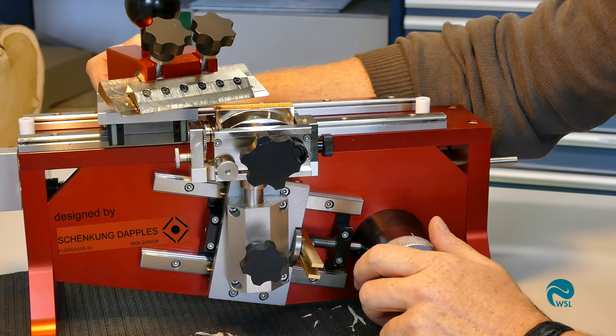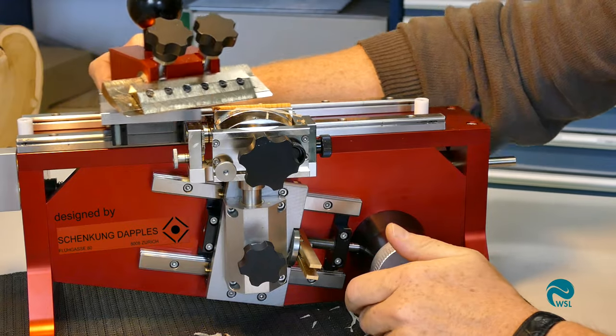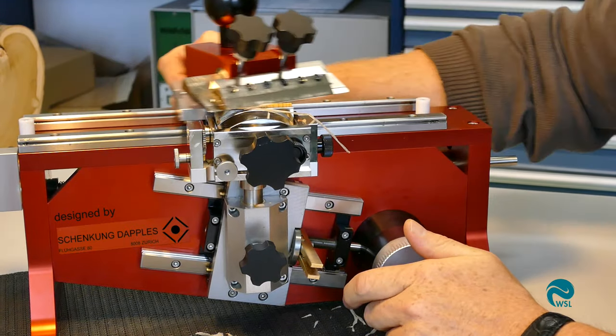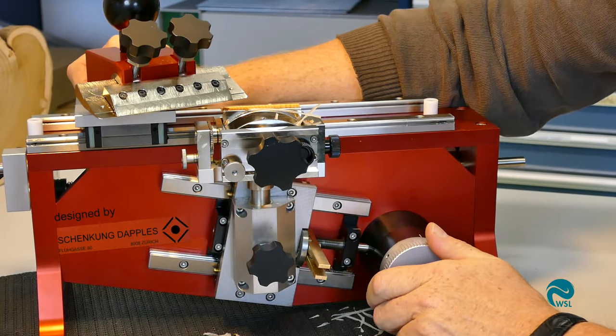First, you need to obtain a perfectly continuous surface on the top of the sample. To achieve this, the sample needs to be raised in steps of 20 to 30 microns and planed with the blade.